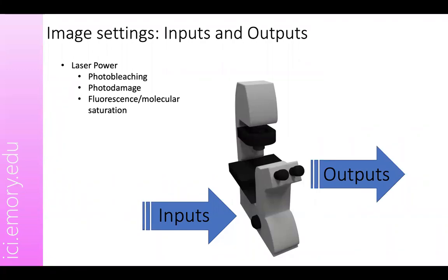Now, photobleaching is going to be a big deal if you are using live cells, but if you are using immunofluorescence, photobleaching might not be a big deal because of the mounting media that you are using. A lot of mounting media come with reagents that can quench the toxic ROS that get produced to bleach your fluorophore. So if you are using immunofluorescence, photobleaching might not be a huge deal, but definitely it's a big problem if you are using live cell samples.